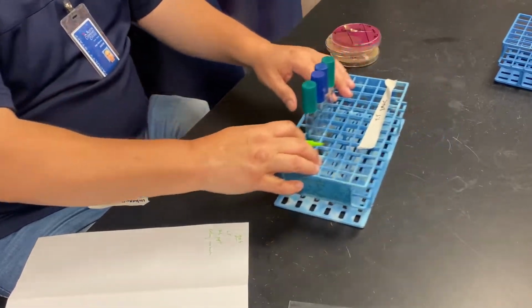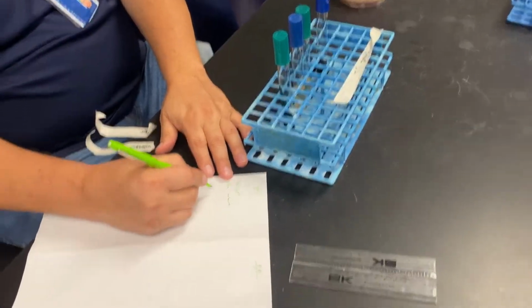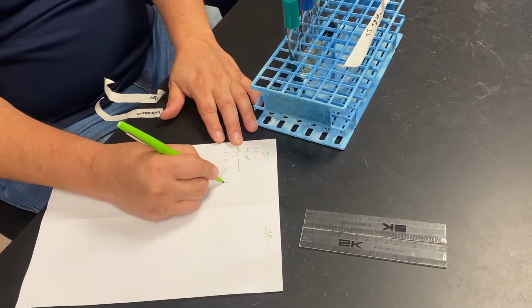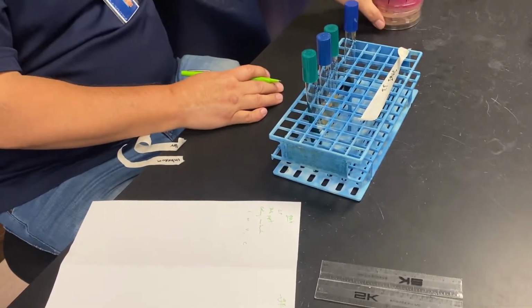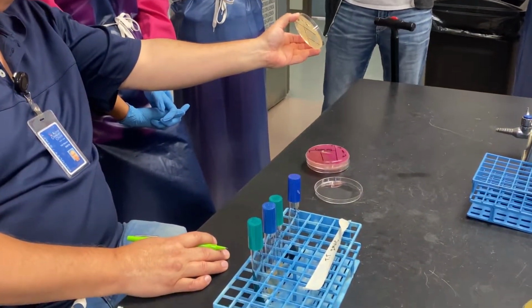So now I'm going to look at IMViC. Which media were you looking at when you saw that it was umbonate? Oh, the TSA. Okay.